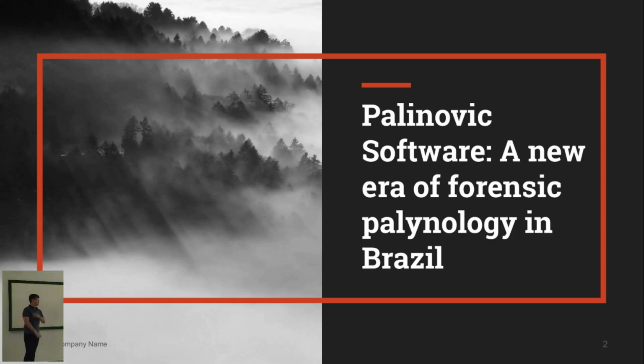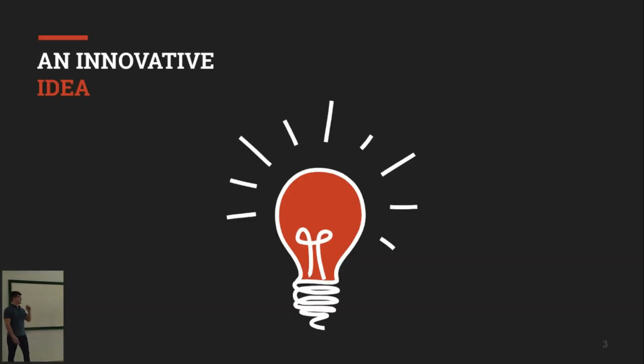I'd like to talk about a new era of forensic palynology in Brazil. And this new era is a result of the use of the software Palinovic forensic edition.